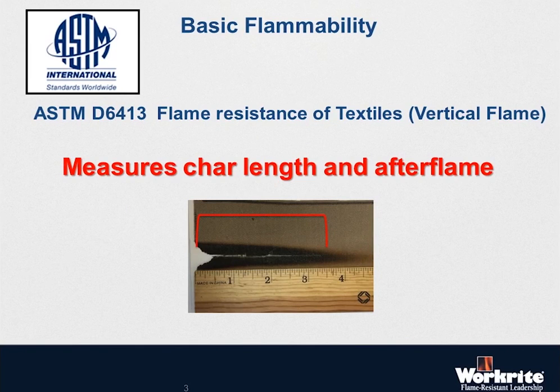You take the fabric, you fold it and crease it through the center point of the charred area. You apply a small weight to one corner of the fabric, and then you measure the char length. And you can see in this particular case, it's about 3.5 inches of char length that's considered. Depending on which standard, the amount of maximum char length allowed will differ. NFPA 2112, for example, it has to be no more than 4 inches. For the ASTM F1506, no more than 6 inches. It just depends on which standard is, which committee has determined what the acceptable maximum char length might be.